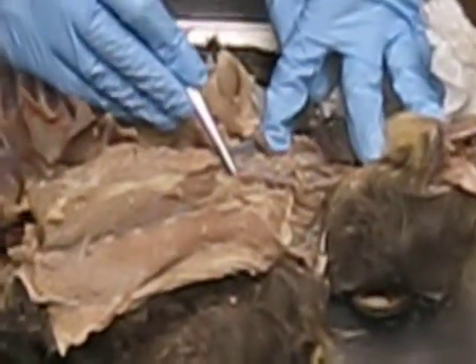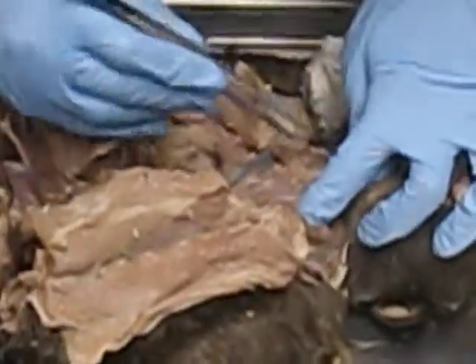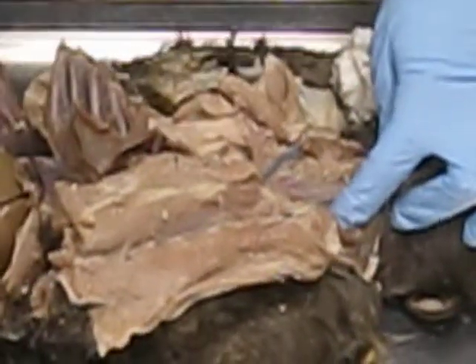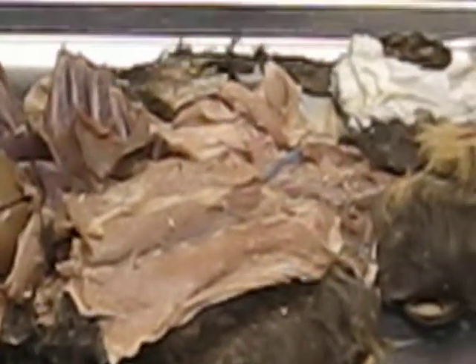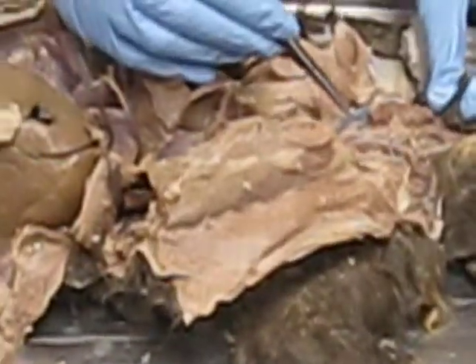And it's just kind of running with the common carotid arteries. And it's not really that visible on this side, maybe right here, a little bit. So if you don't have that visible in your cat, make sure that you see a cat that actually does have it. So that's that. Yeah, internal, external, that part.